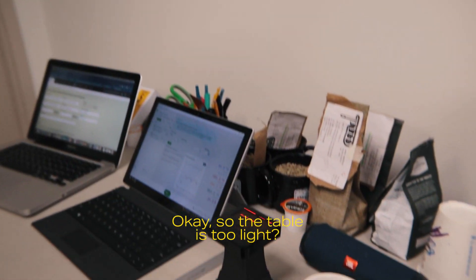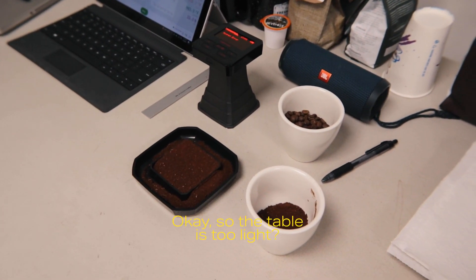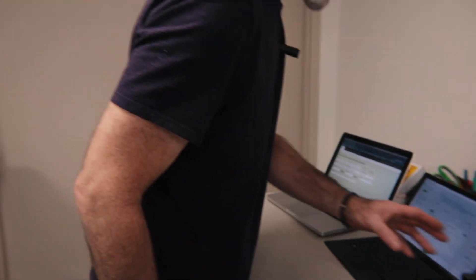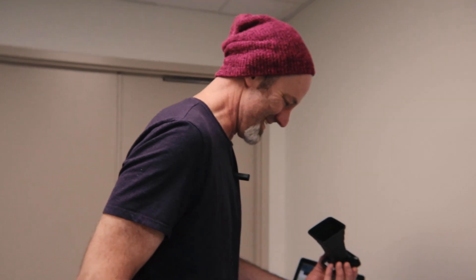There it is. Oh, error. It's way too light. Cool.